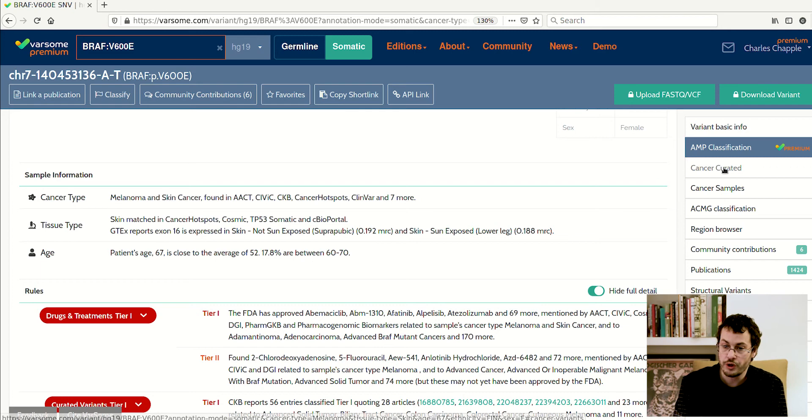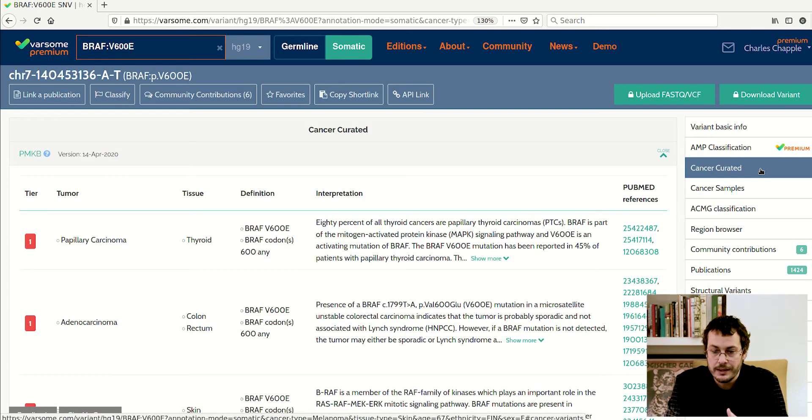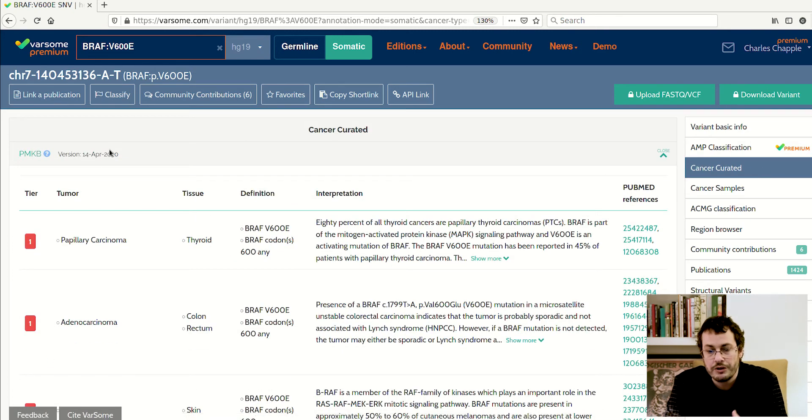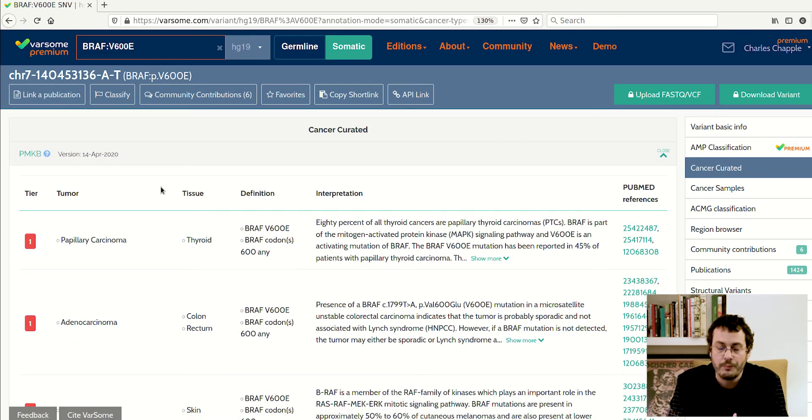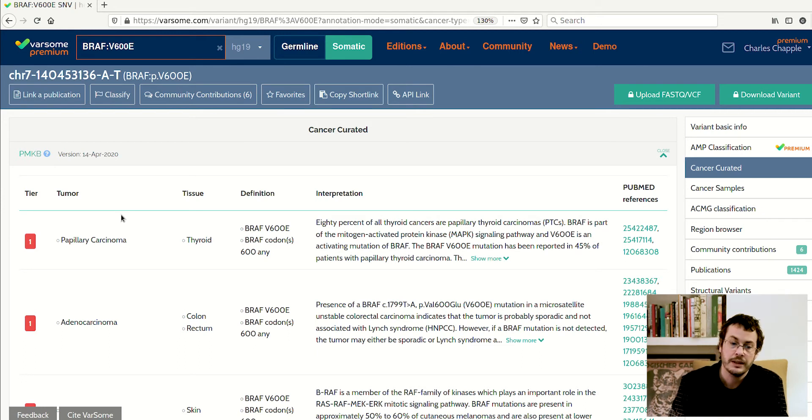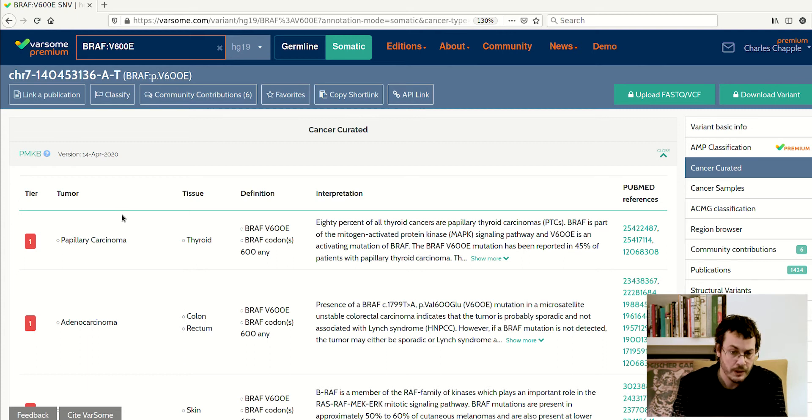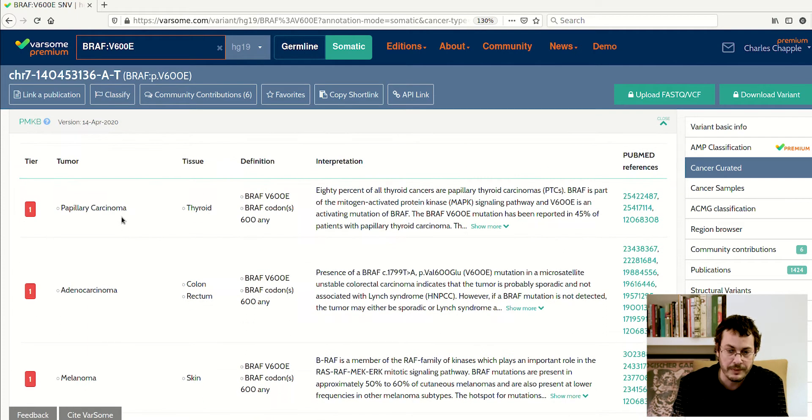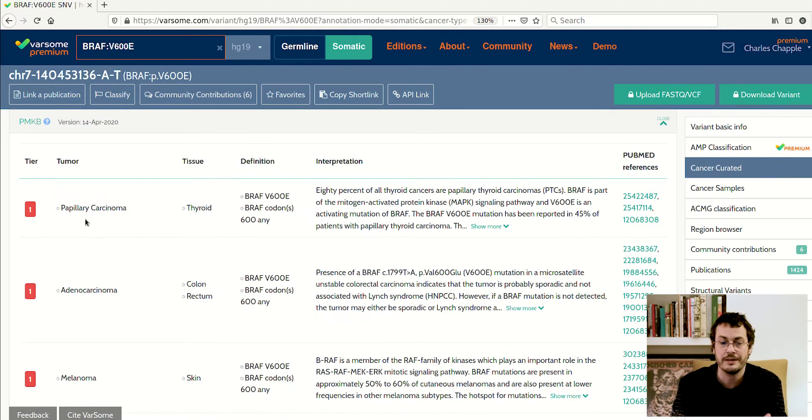The next section I want to show you here is what we call cancer curated, and these are curated databases that have information about this particular variant and the various tumor types it has been found in. In each case, different databases have different information.